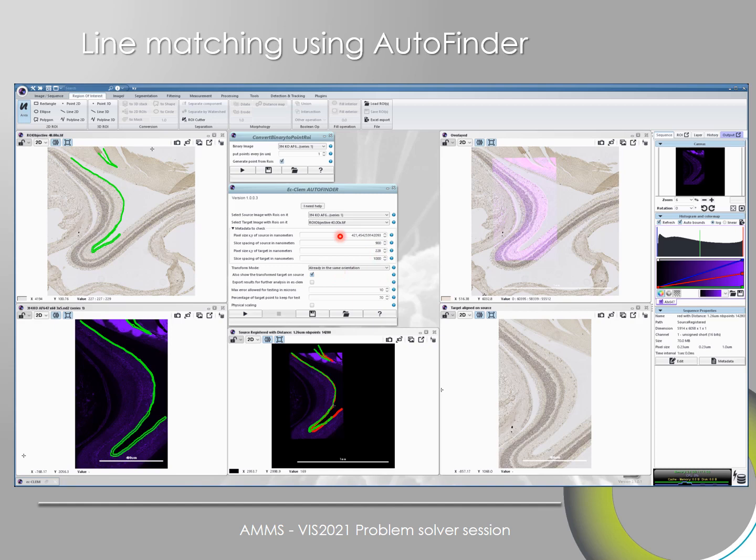And then you let the software calculate the optimal transformation according to your outlines. And as you can see, it does the calculation and registers the images to one another as precisely as possible. So eC-CLEM AutoFinder allows you to do something which is a bit more flexible data correlation. It works also in 3D. I'll come back to that point in a few seconds.